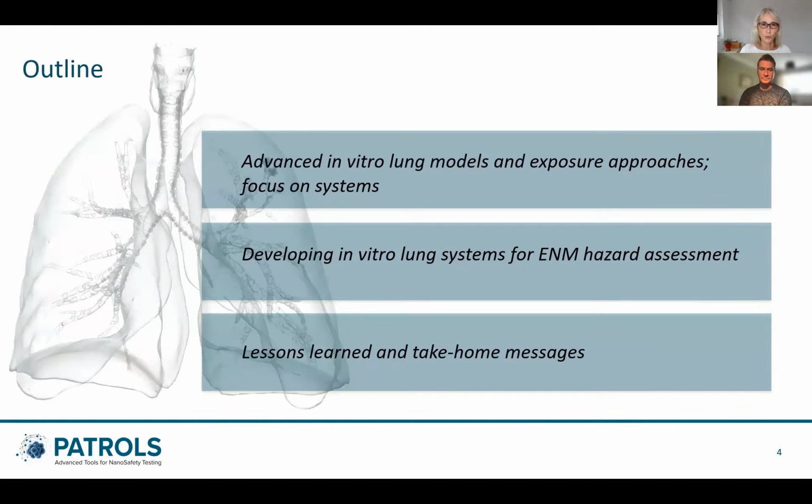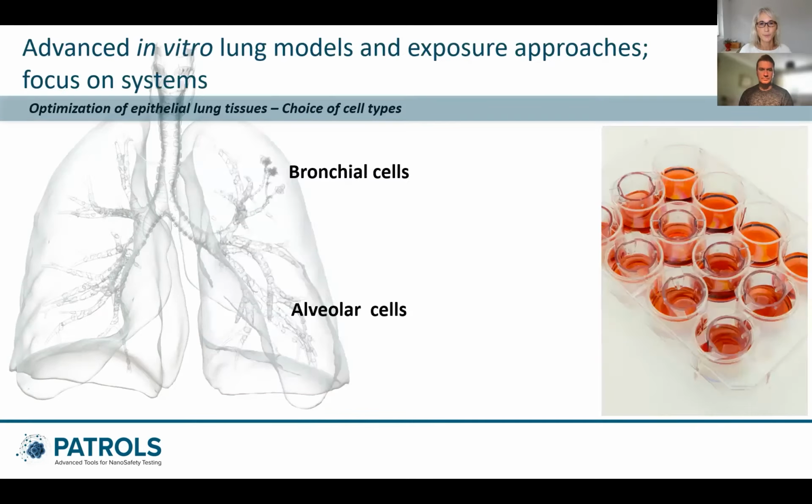So let me give you a quick outline about what we will present. First, we will focus on systems and show you the lung model development and exposure approaches. Then we will show you how we used the optimized systems for nanomaterial hazard assessment. And we will close with some lessons we have learned and take-home messages.